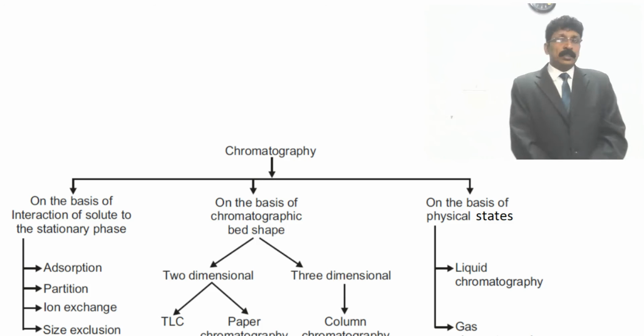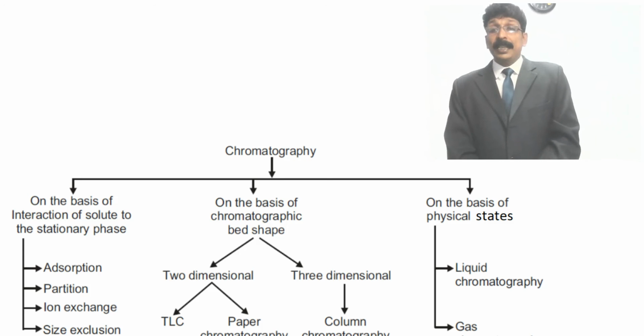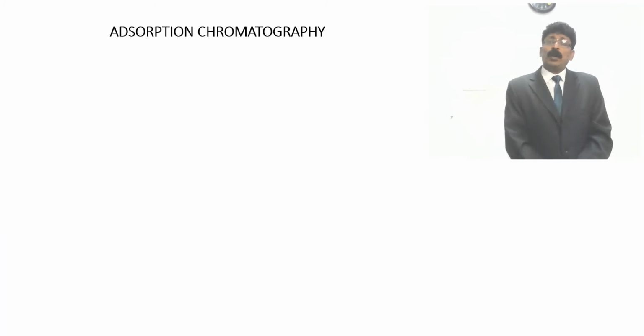So students, remembering the definition of chromatography: first, it is a technique which is used for separating a mixture of compounds. That's very important for you to know. And also now we are going to think about what adsorption chromatography is.